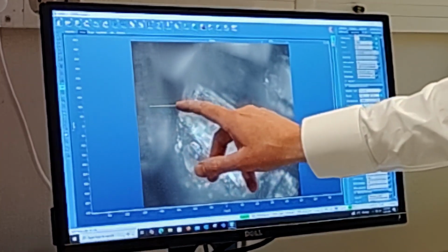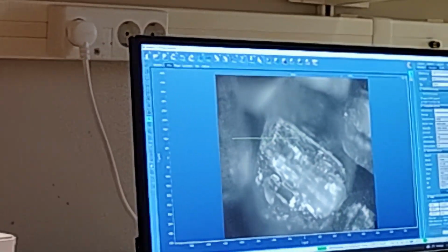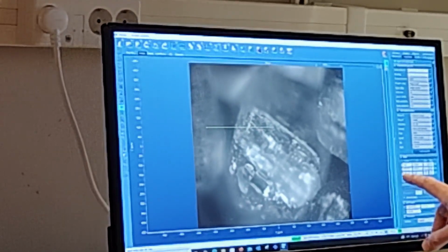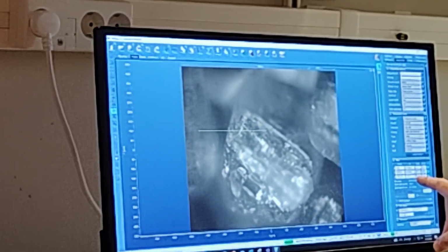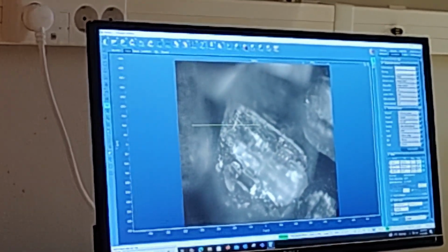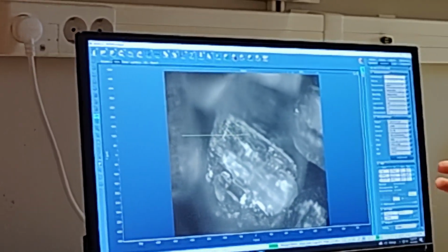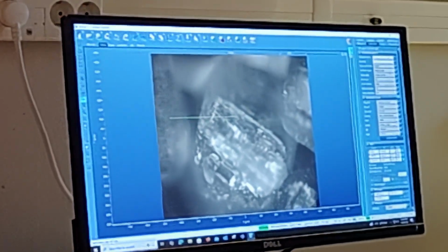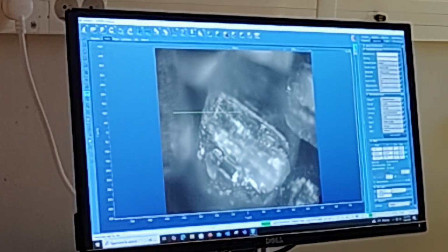And then you see a lot of points, what shall I say, marks here. So if I go down here, it says map, and here you can see the positions. So it's 400 points now in the X direction. That's a lot of points. If we want to scan for 1 minute, that's 400 times 1 minute. So here you can see it becomes very important to have fast spectra acquisitions if you do mapping. Otherwise it takes forever.